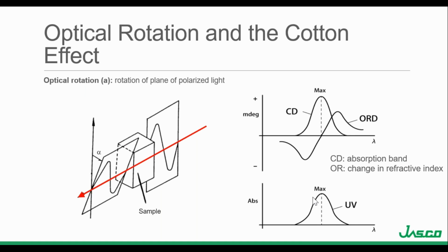Chiral molecules exhibit circular birefringence, or optical rotation, where the velocity of light passing through an optically active medium is going to differ depending on the medium's refractive index and rotate the plane of polarized light. CD spectroscopy exploits the fundamental property described by the Cotton effect, or the dependence of CD on wavelength.